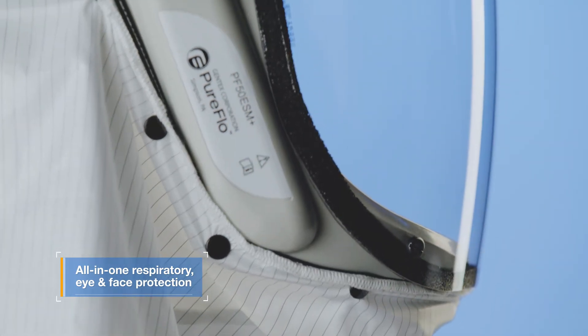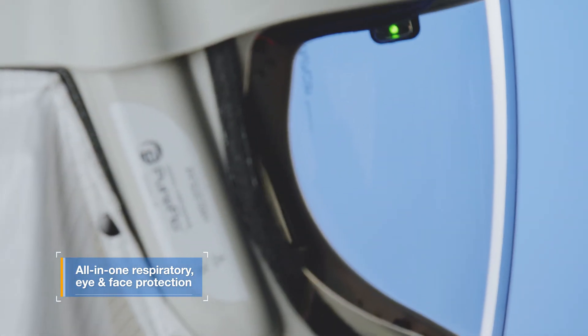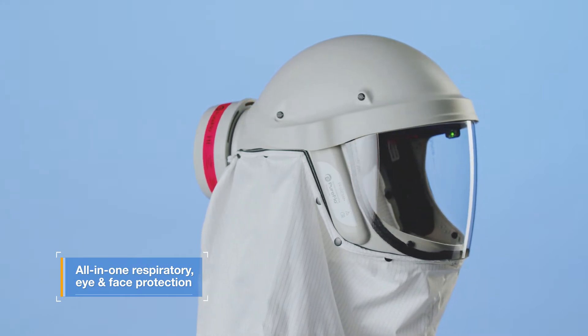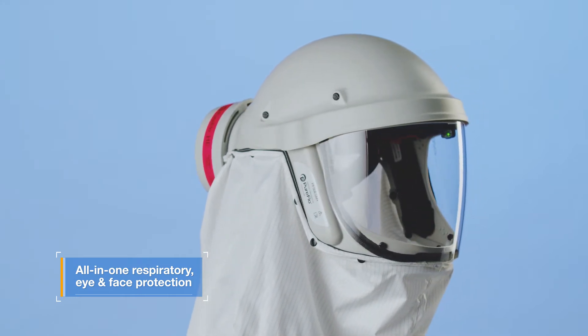This all-in-one PAPR provides integrated respiratory, eye, and face protection against hazardous airborne particulates, ideal for the most demanding pharmaceutical and cleanroom environments.